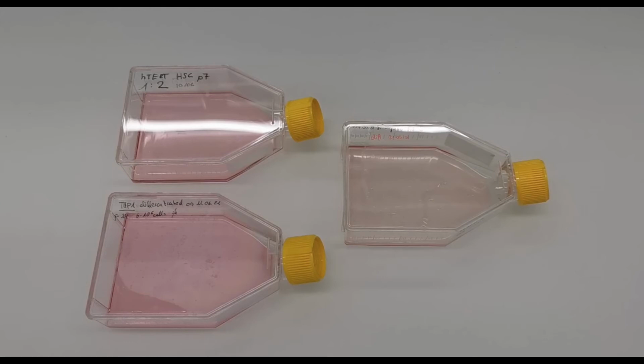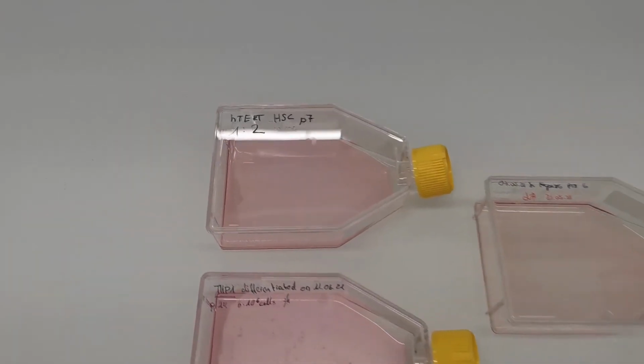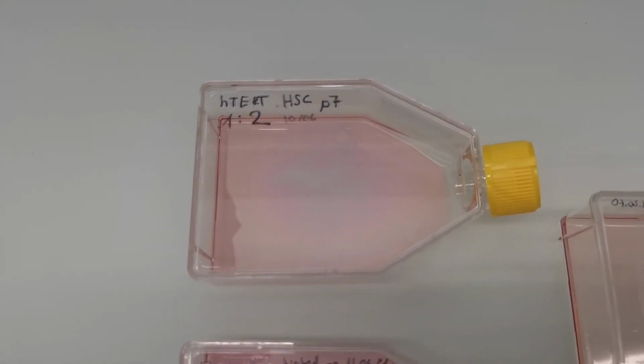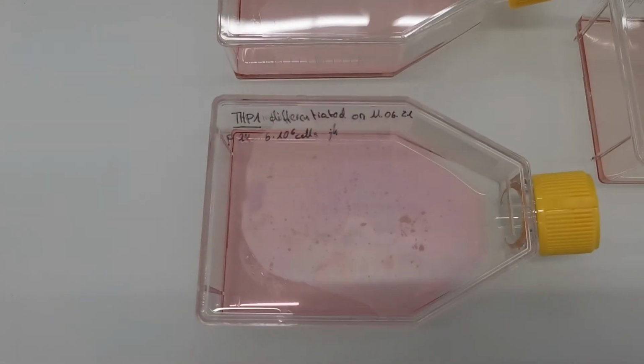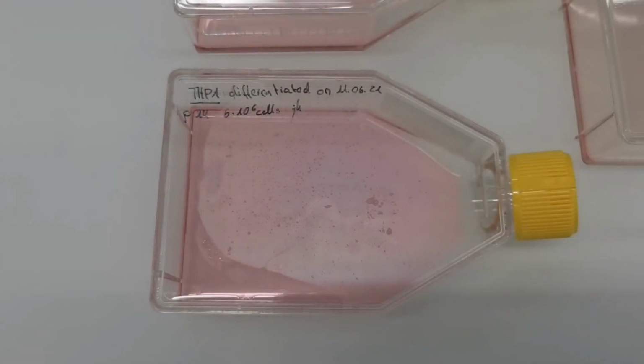Today, we will generate 3D human liver microtissues using 3 cell lines, so this is a triple model. We will use the cell line HTERT-HSC, which are an immortalized human stellate cell, and was kindly provided to us by Dr. Bernd Schnabel. We will use the human monocytic cell line THP1 from Cell Line Services, and these are differentiated into macrophages using PMA for 48 hours, followed by a 24-hour rest period prior to use. These are a surrogate for Kupffer cells.